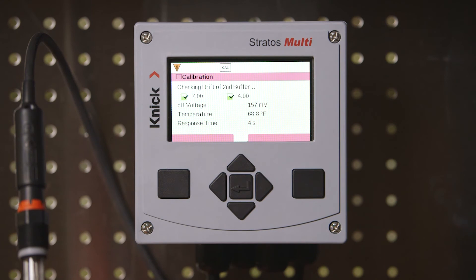As with the first step you can see that the transmitter automatically recognizes the second buffer value, displays the pH voltage, temperature, and response time.